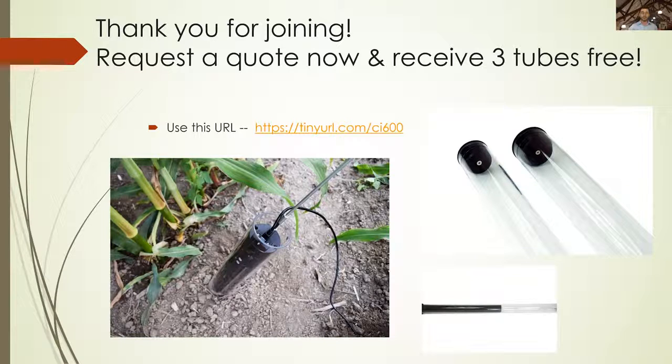So I would say keep that white calibration tube with you. To calibrate, it's really easy. You just stick it in, make sure it's in the home position, and press go. Also, if you're going to change the resolution, say you want to do the initial soil scan of the topsoil, you'll want to do 100 DPI because you just want to get an idea of where the roots are. But the lower you go, that's where you're going to want to see your mycorrhizae, your fine root hairs, your parasites. So at that level, you want to get more to the 600 and the 1200. To do that, you would scan at 100, pull it out, do the calibration at 1200, and then put it back in. Thankfully, because you can measure it out, you'll be able to know where those scans overlap, and you'll be able to tie them all in very quickly using RootSnap.